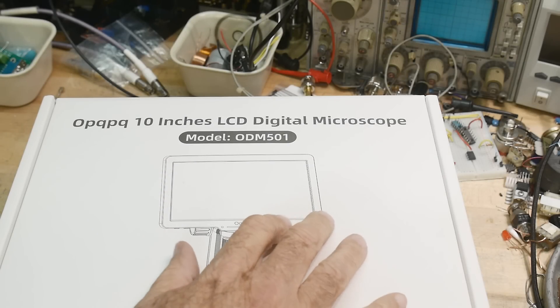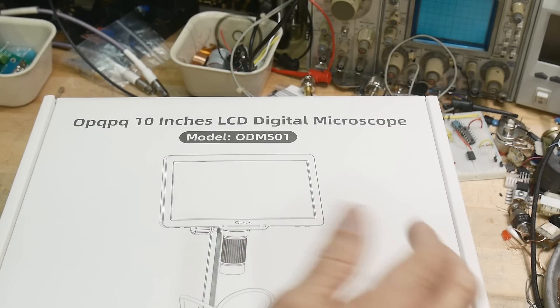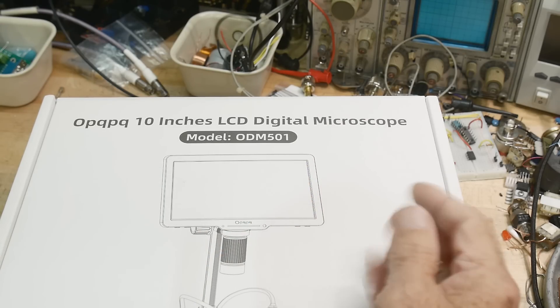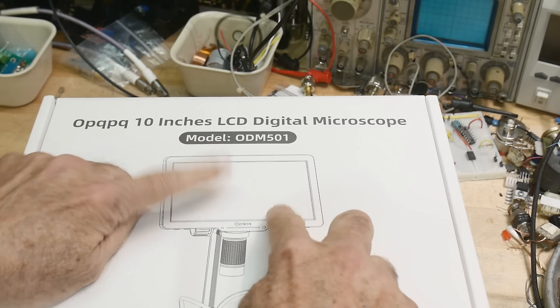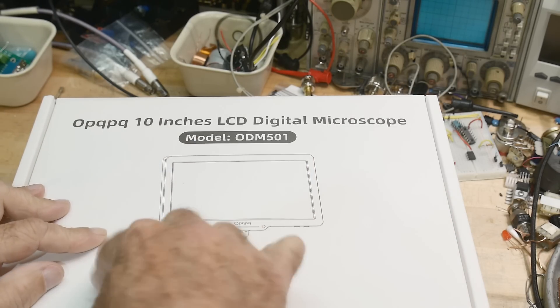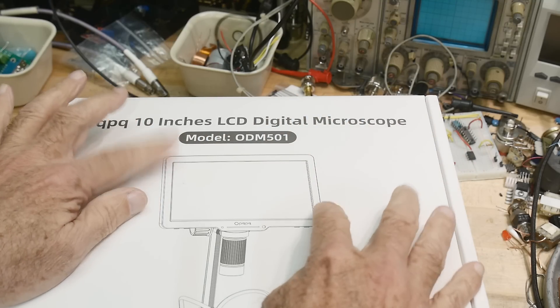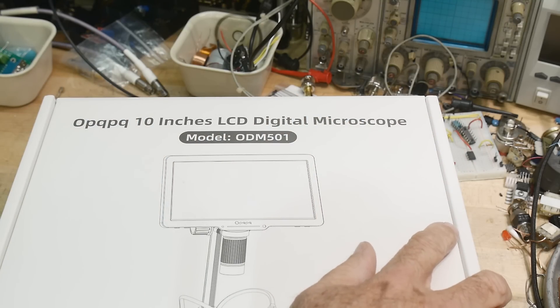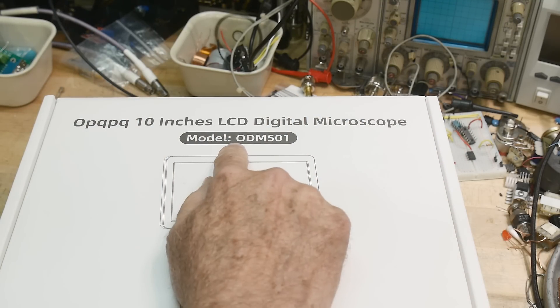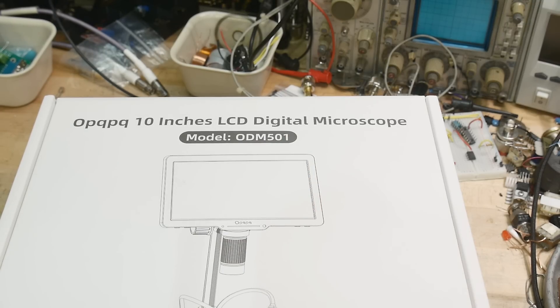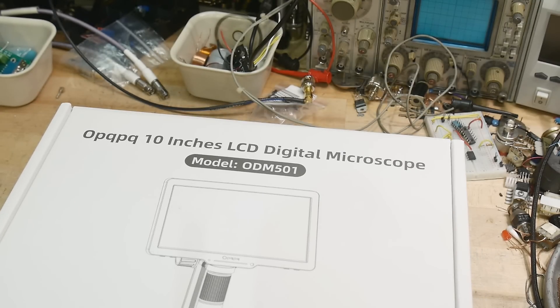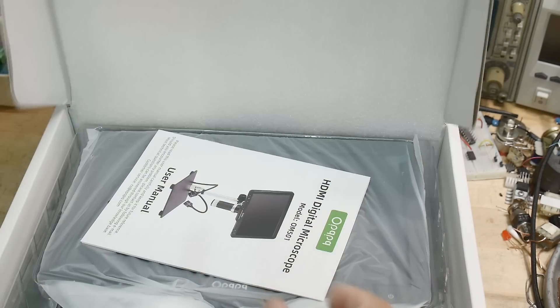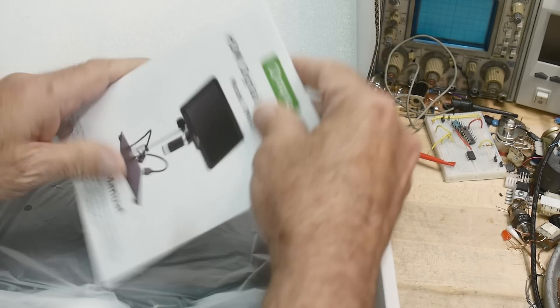All right, this was sent into the channel for review, another microscope. I reviewed a microscope earlier that was a 7-inch microscope, same form factor. This is a 10-inch LCD panel, so much nicer. Let's take a look at that one. This is an ODM 501.